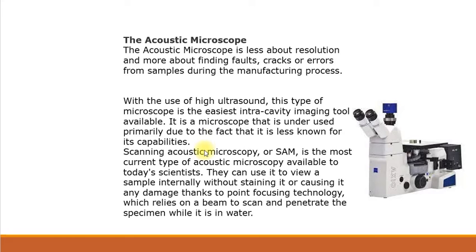Scanning acoustic microscopy, or SAM, is the most current type of acoustic microscopy available to today's scientists. They can use it to view a sample internally without staining it or causing it any damage, thanks to point focusing technology, which relies on a beam to scan and penetrate the specimen while it is in the water. So this is also a good advantage of this microscope, that we don't have to go through the long procedure of staining and preparation. We just have to put the sample in water for magnification or for observing under the microscope.